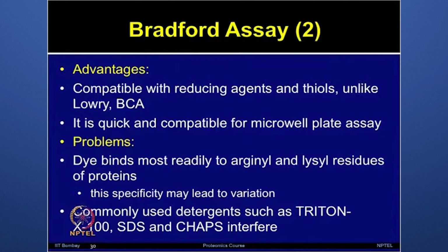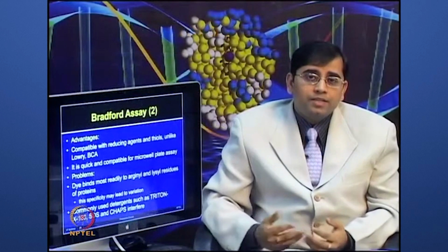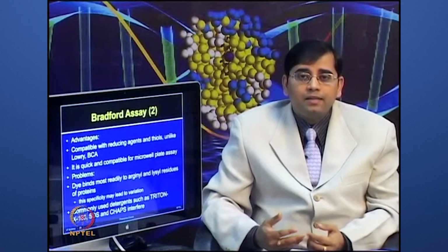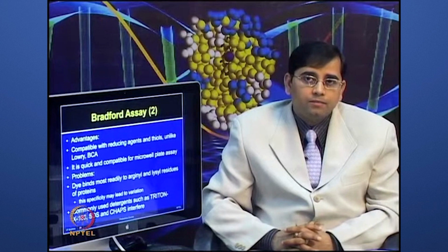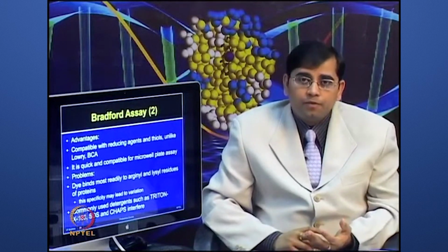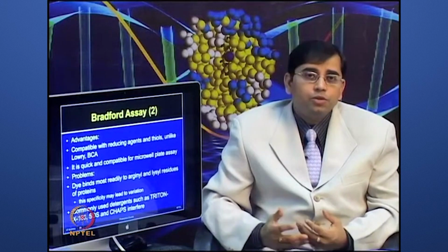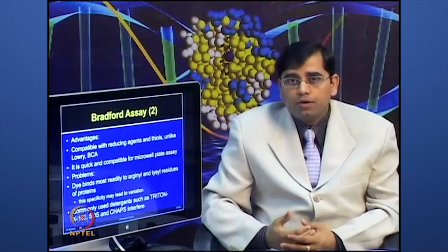They also interfere with the Bradford assay. So, researchers have come up with various types of modified Bradford assays for specific applications. Again, you have to keep an eye on what the components of your buffer are, and you need to ensure that it is compatible with the assay conditions or not.